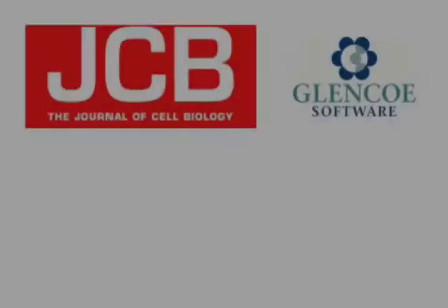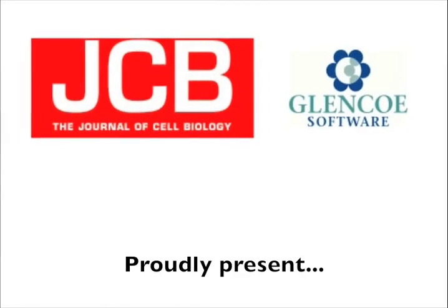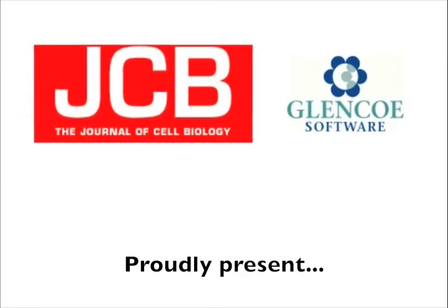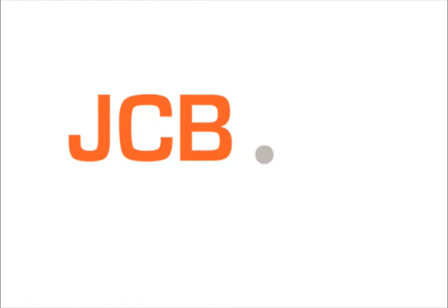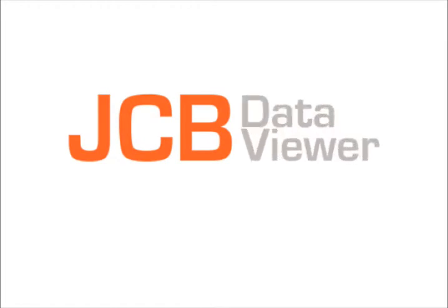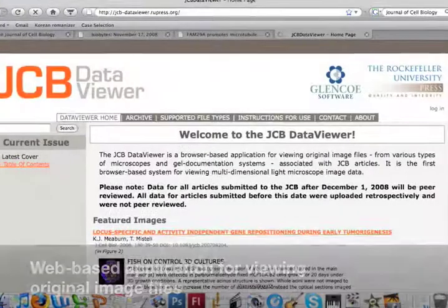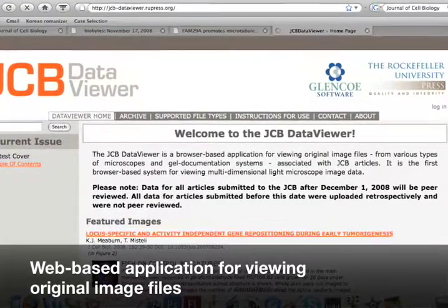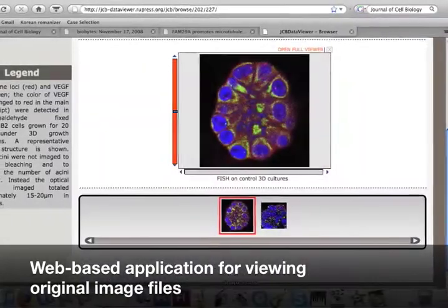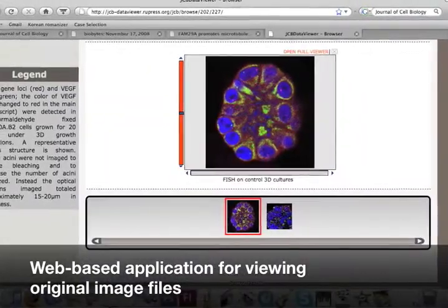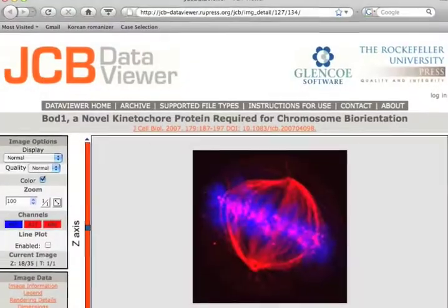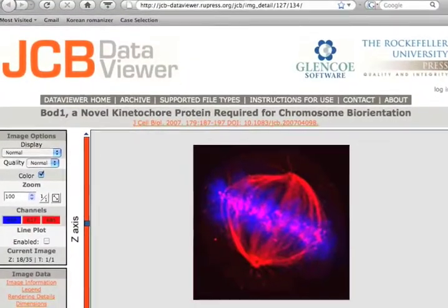The Journal of Cell Biology and Glencoe Software proudly present the JCB Data Viewer, the first web-based application for viewing original image files. This unique browser-based application allows you to interact with the image that you see and perform some simple analyses.